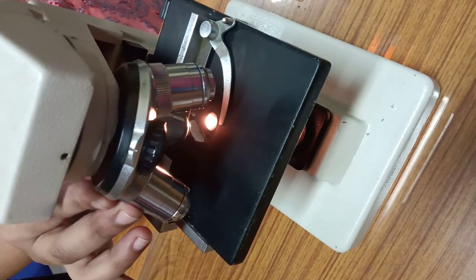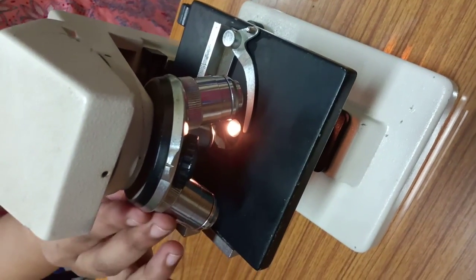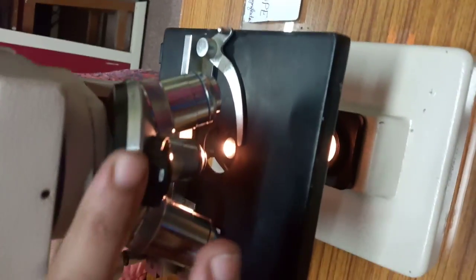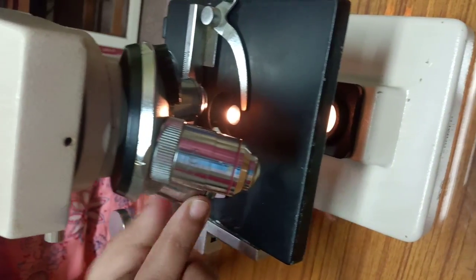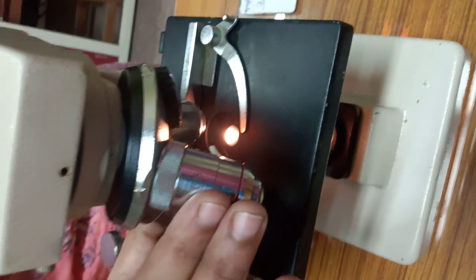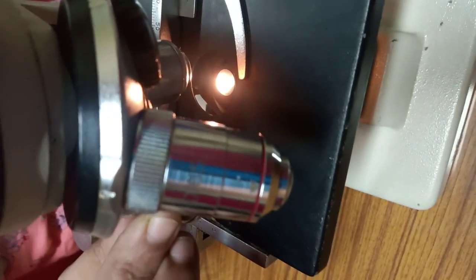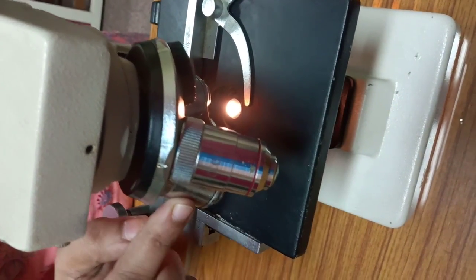Now this nose piece helps to hold multiple objective lenses. Objective lenses are supported by the revolving nose piece, and you can set whichever lens magnification you want. Here we see that the objective lenses are there. At the lower end of a typical microscope, there are one or more objective lenses.